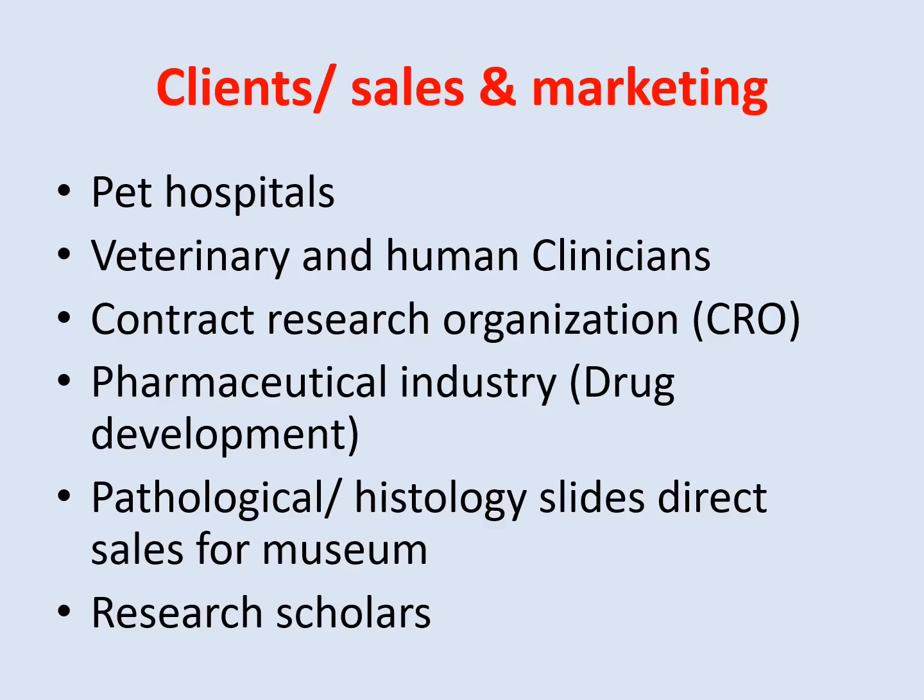This is the beauty of this technique, that histopathology is the same. Whether you are applying it in veterinary pathology or human pathology, the procedure is totally the same. And these veterinary and human clinicians are in regular need of these histopathology techniques or pathological diagnosis.